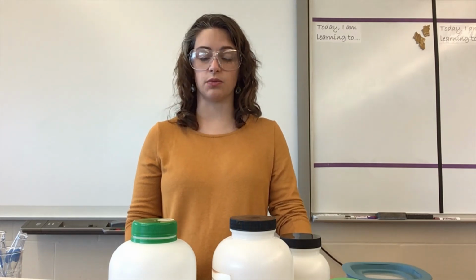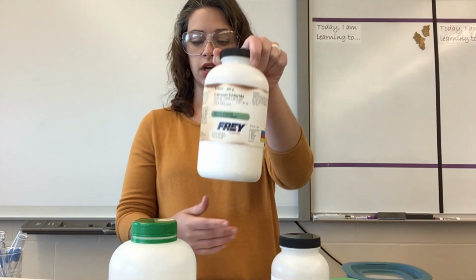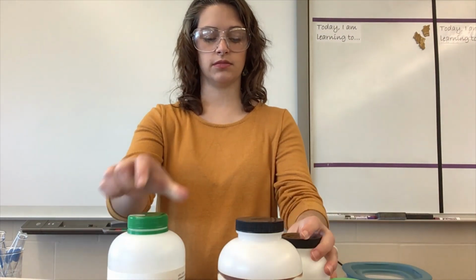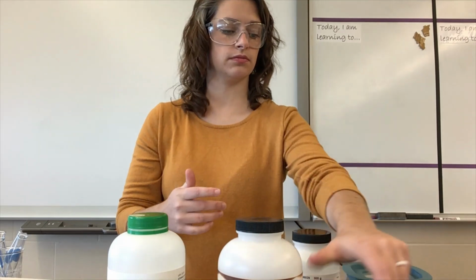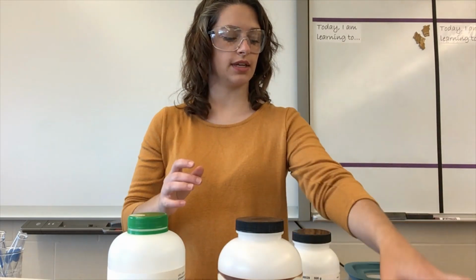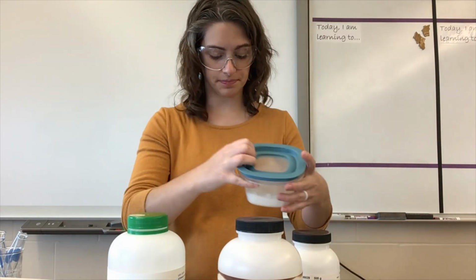So the different compounds that we're going to test in lab today are calcium chloride, urea, sodium bicarbonate, potassium iodide, sucrose in the form of sugar cubes, and naphthalene in the form of crushed up mothballs.